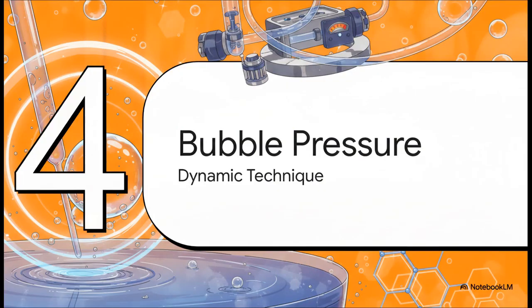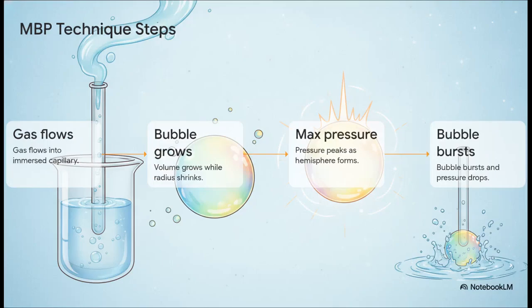That brings us to Part 4, the bubble pressure technique. This one is the maximum bubble pressure method. Here, gas is pumped into a submerged capillary tube at a highly controlled rate. As the bubble grows, its radius actually shrinks, which causes the internal pressure to spike. That pressure hits its absolute peak right at the exact moment the bubble forms a perfect hemisphere. Pop! The bubble bursts immediately after. By tracking that characteristic spike in pressure, scientists can easily calculate the surface tension.